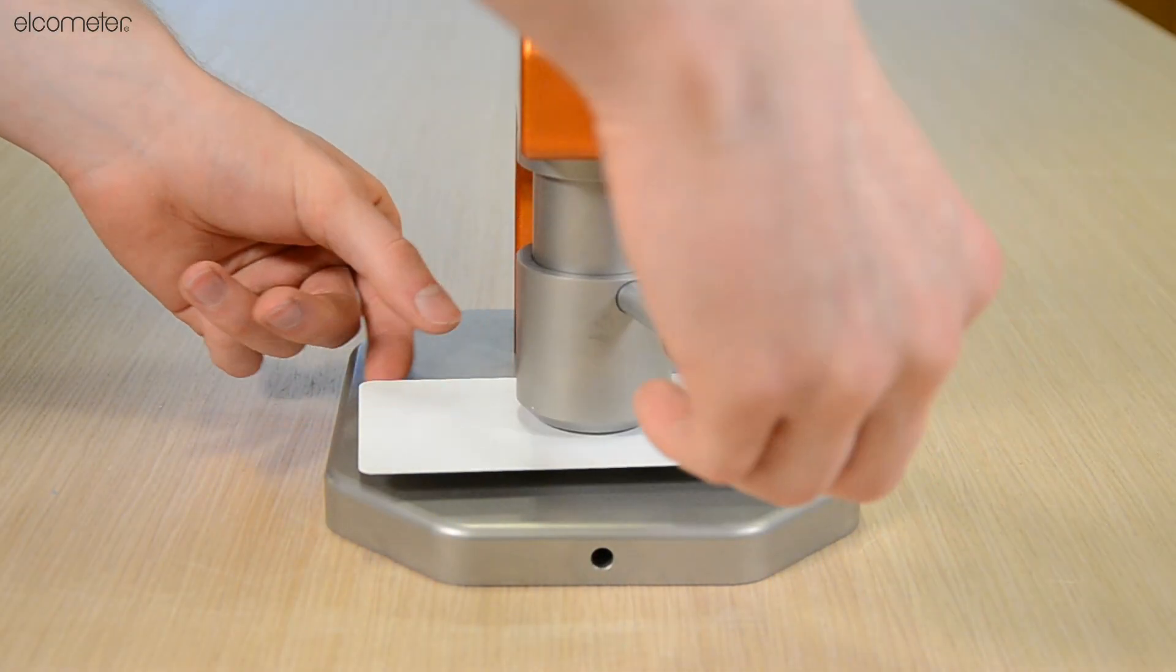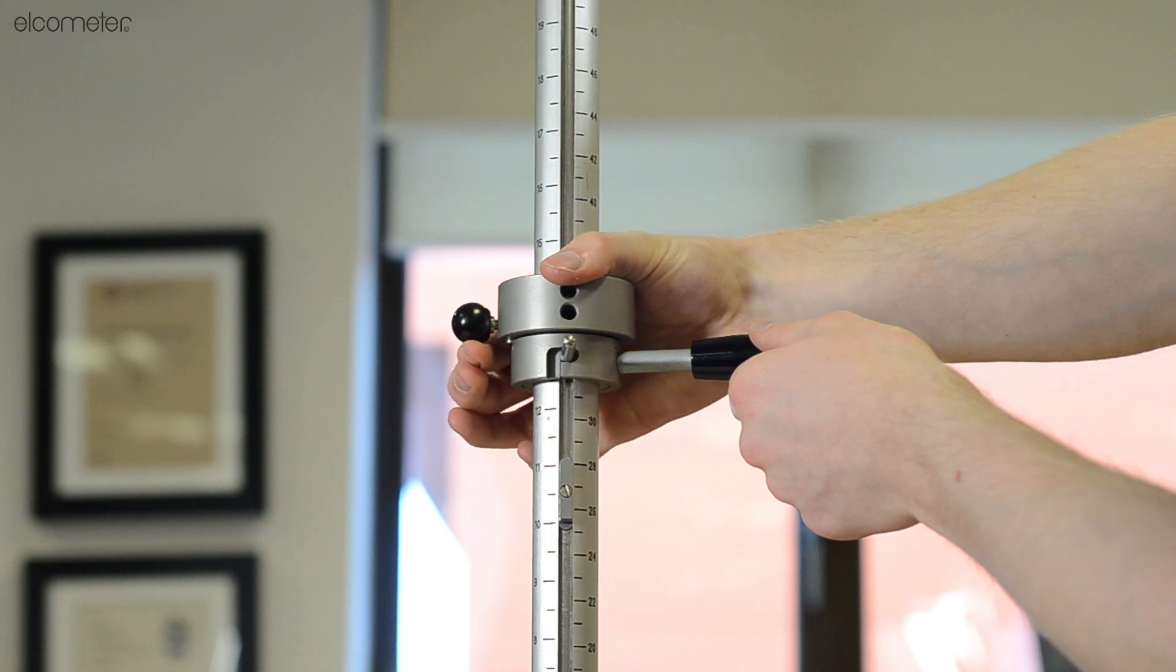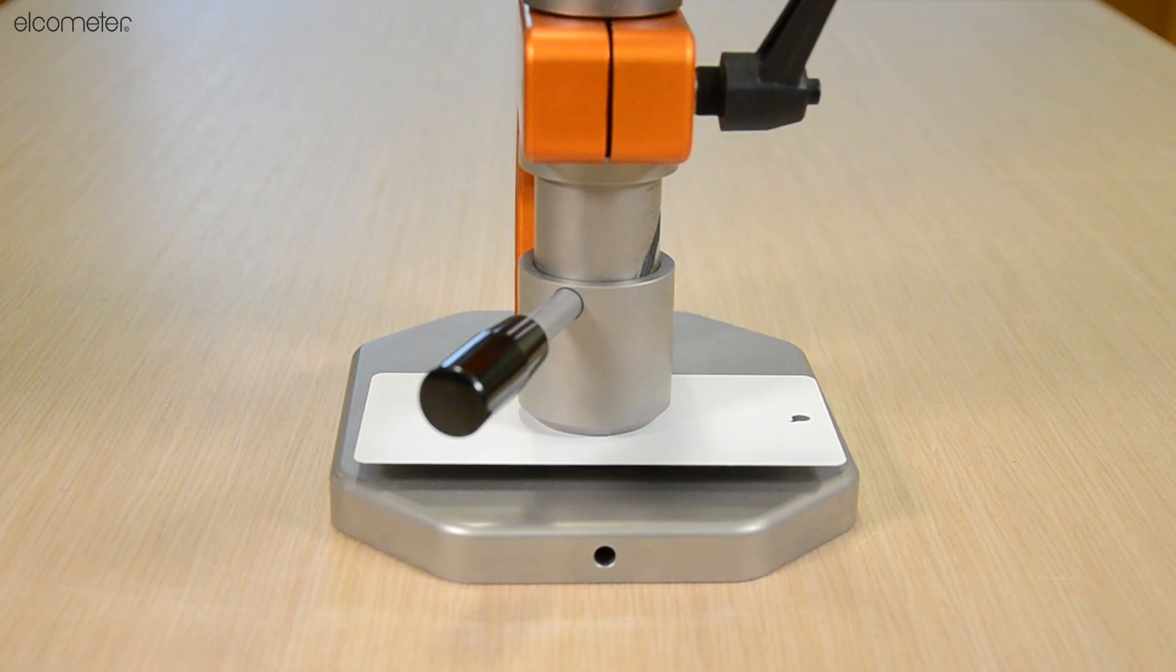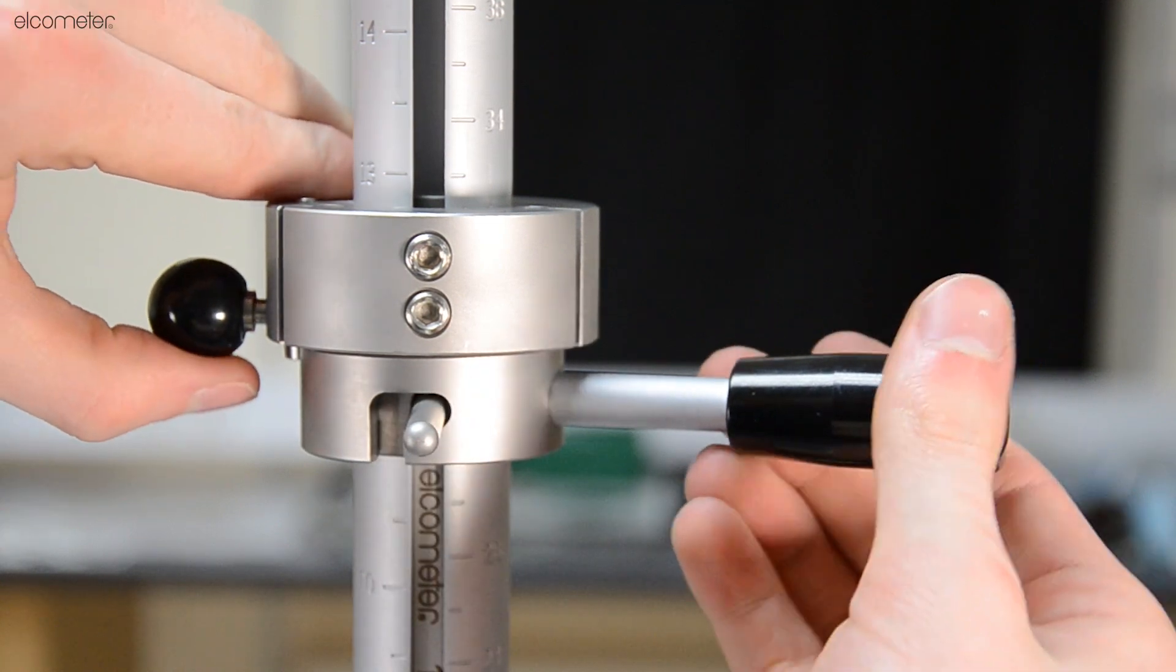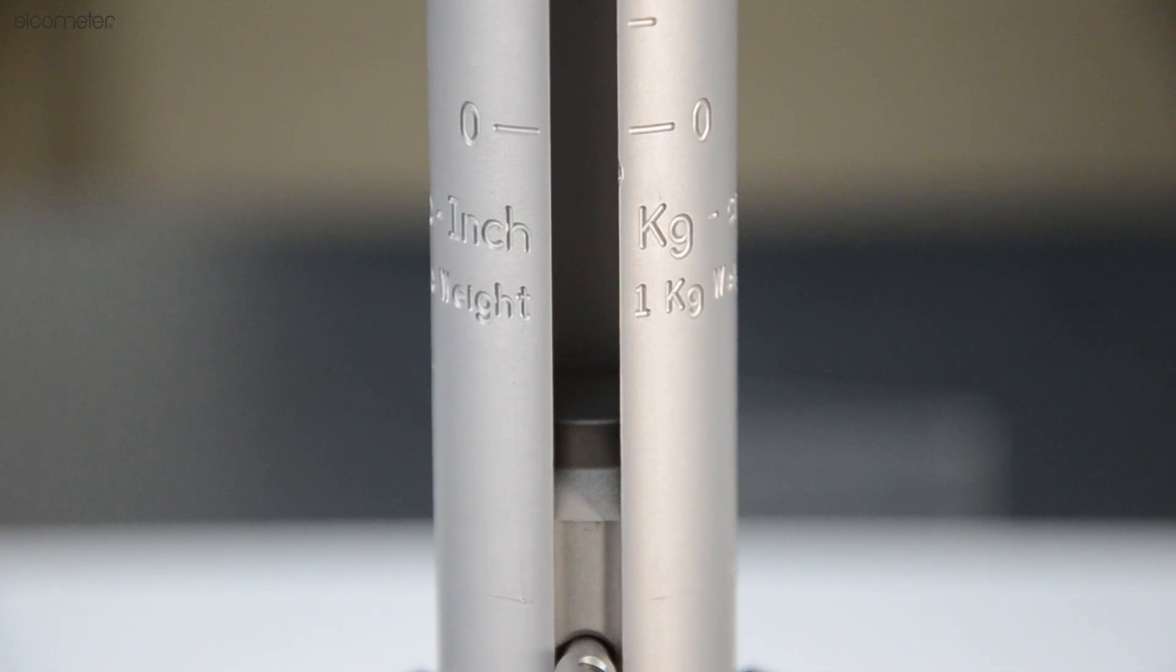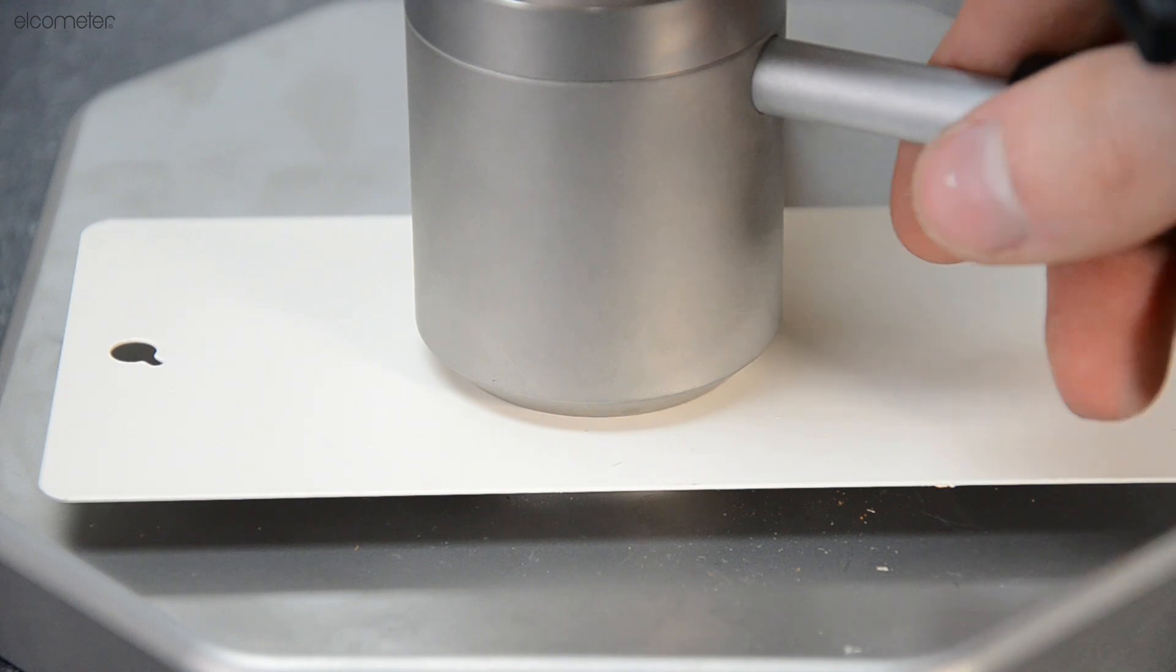A direct test consists of a weight with a hemispherical punch falling directly onto your sample, whereas an indirect test consists of a weight falling onto an indenter which is resting on the sample.